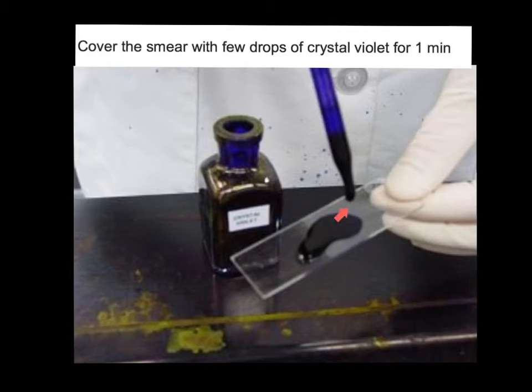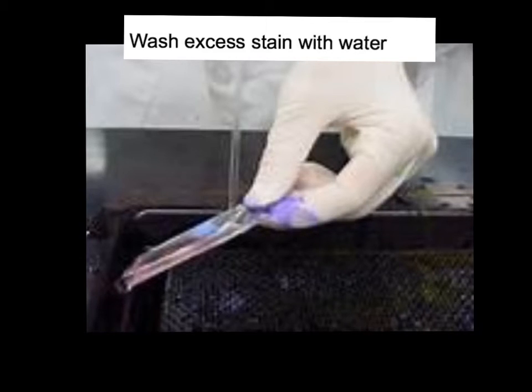Now I know that my directions up here say a few drops, but let's saturate this bacteria smear with crystal violet and let the crystal violet set for 1 minute. Now if you go a little longer, that's fine, but at the end of 1 minute we will rinse the crystal violet off. And here we are rinsing the excess stain off with water.